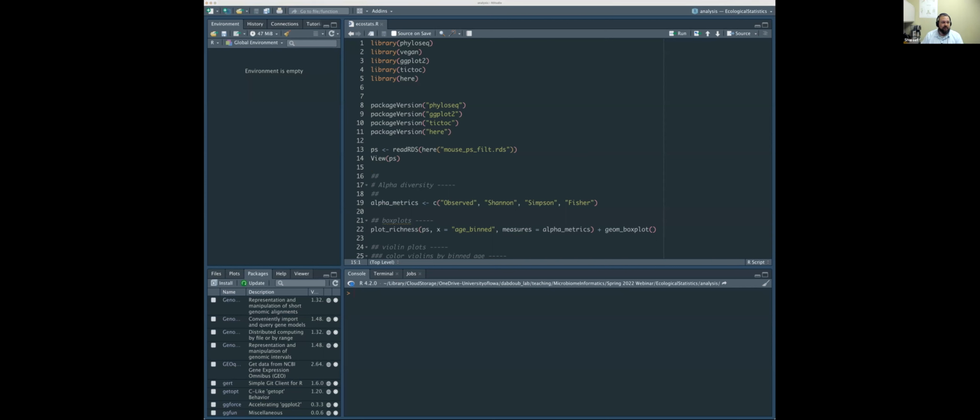All of that can also be seen in the GitHub link I sent everyone, under DADA2 or QIIME or mothur, the process for analyzing that data. Specifically, the RDS file was created by the DADA2 process that I went through, the dada2 analyze.R under the DADA2 function folder in the GitHub page.